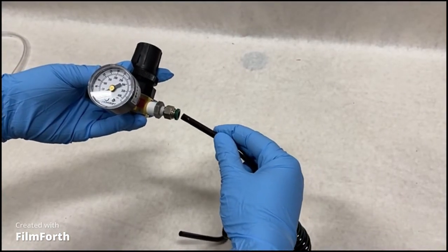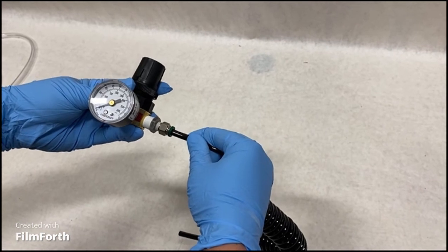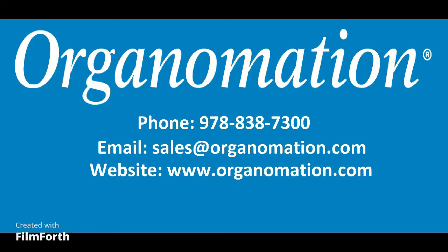The third way is to connect the black tubing directly to a push-to-connect fitting. This is common when connecting to air compressors, pressure reducing regulators, and nitrogen generators such as Organimation's Nitrogen.